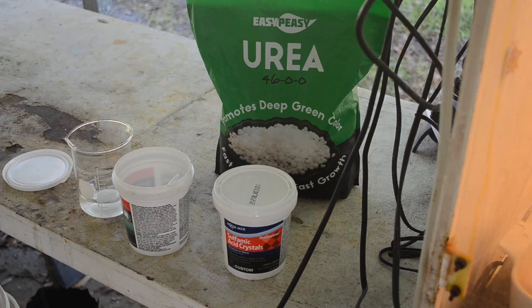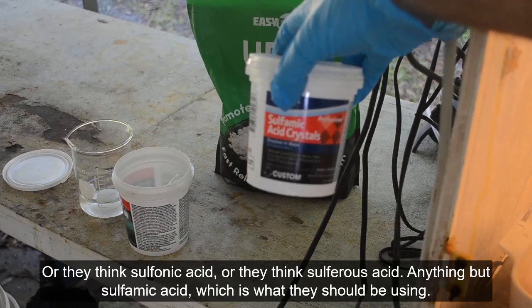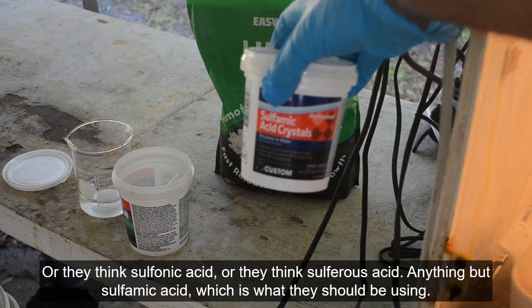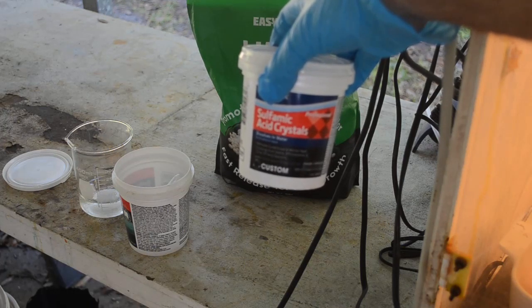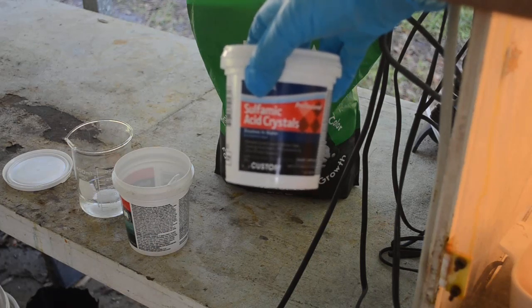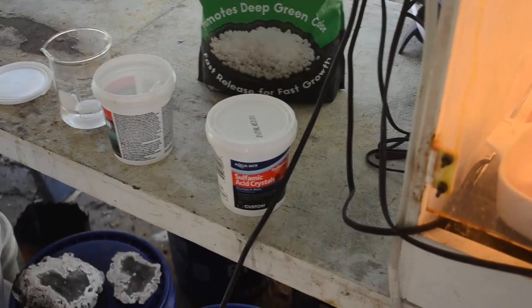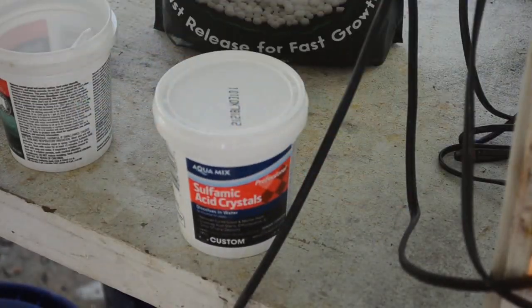Urea nitrate is also a fairly insoluble compound. When your liquid cools down you'll see this white cottage-cheesy stuff precipitating — that's the urea nitrate. It's very annoying and also very dangerous, so I try not to use urea except in a few special situations where basically nothing else is working. Usually I will be using sulfamic acid. This is another source of confusion: people hear sulfamic acid and think sulfuric acid. I've had more than a couple of people tell me they put sulfuric acid in their liquid and it didn't denox it — well, of course not, sulfuric acid does not denox your liquids.